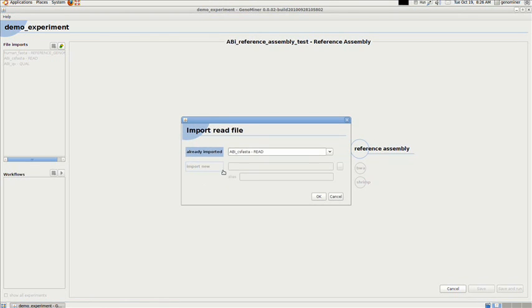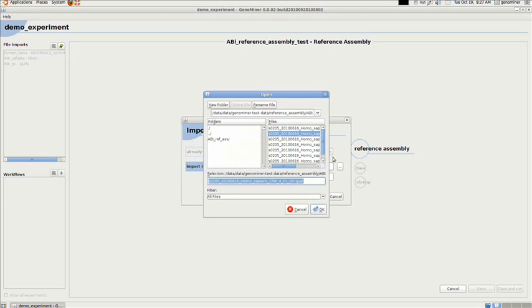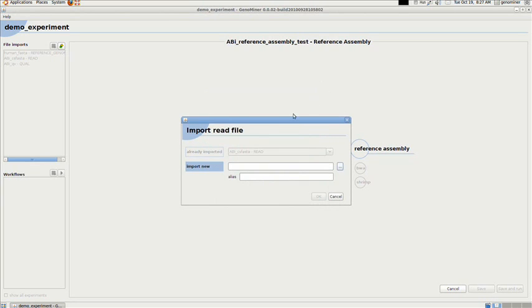Before setting the parameters of the error correction tool, the system displays the files we intend to analyze further. The aim of this simple step is to make sure the user has chosen the correct files. Furthermore, it provides an opportunity to change files as needed. The input of the SAET error correction tool consists of SOLiD reads in CS/FASTA format, a file with quality values in qual format, and an expected length of the sequence from which reads were sampled.